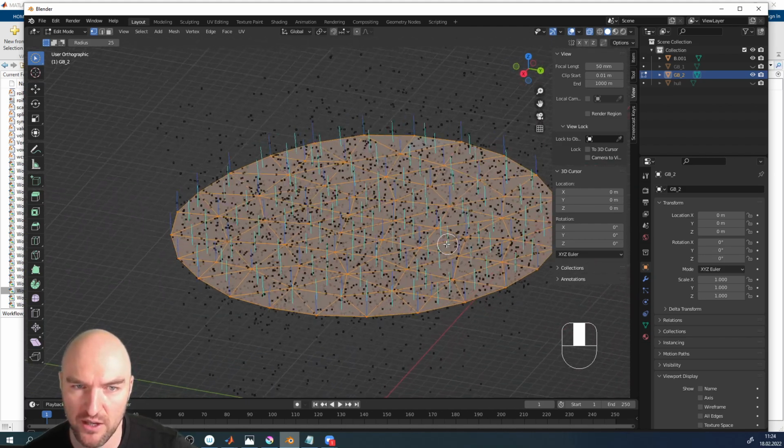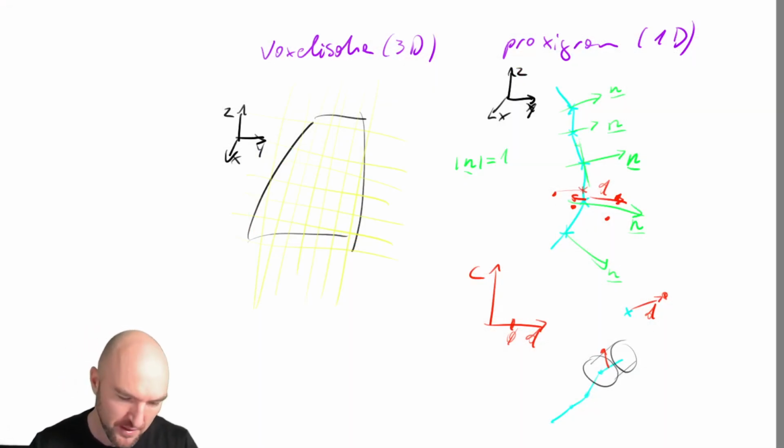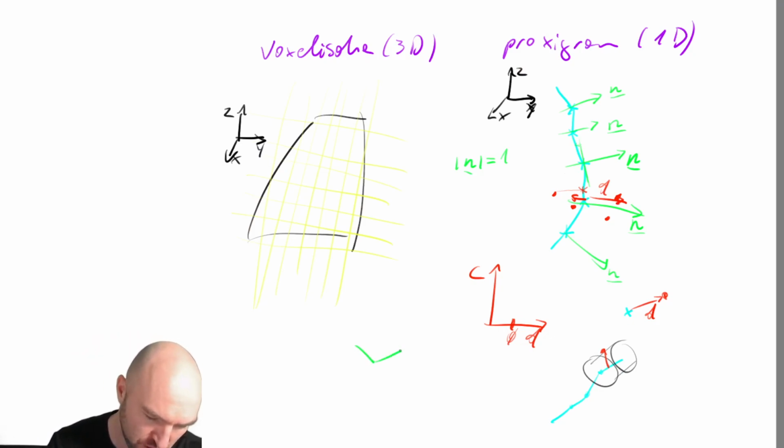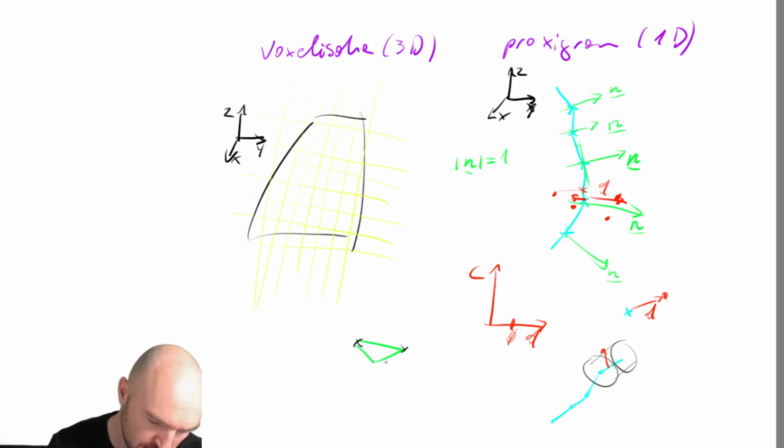And this is actually all the way it should be. And the question is now, how does it know which direction each triangle has its normal? And this is actually done very simply, implicitly, unfortunately. It's done implicitly by if you have a triangle, and the triangle has vertices 1, 2, and 3.